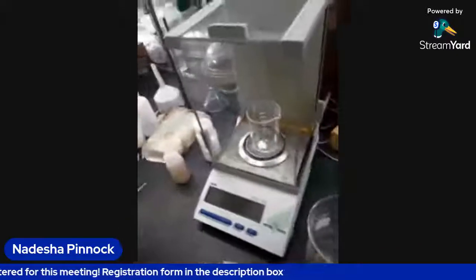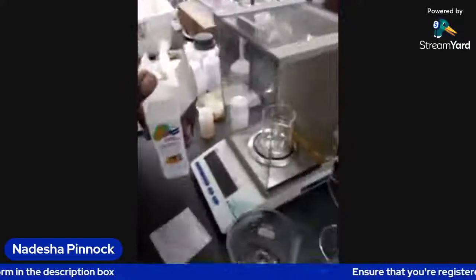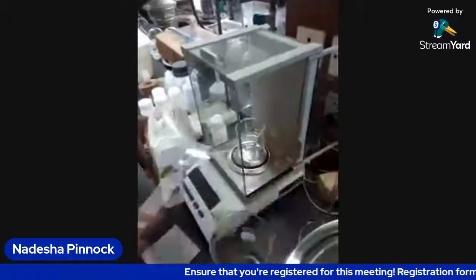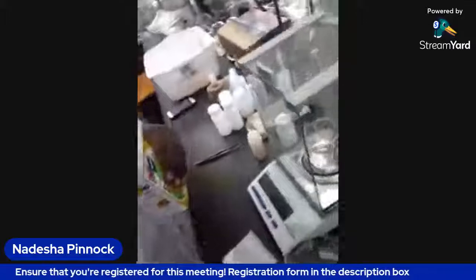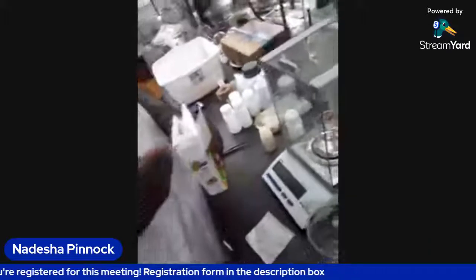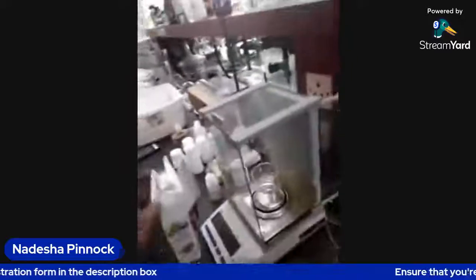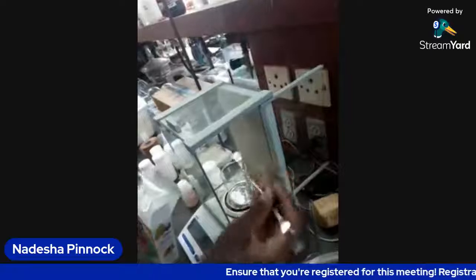That's right. Yeah, way more than that. Couple spatulas. So 10 grams is quite an amount. And when you're weighing, you want to not touch the beaker because the weight of your hand will affect the mass. So we're just at about 1.2 grams thereabouts.